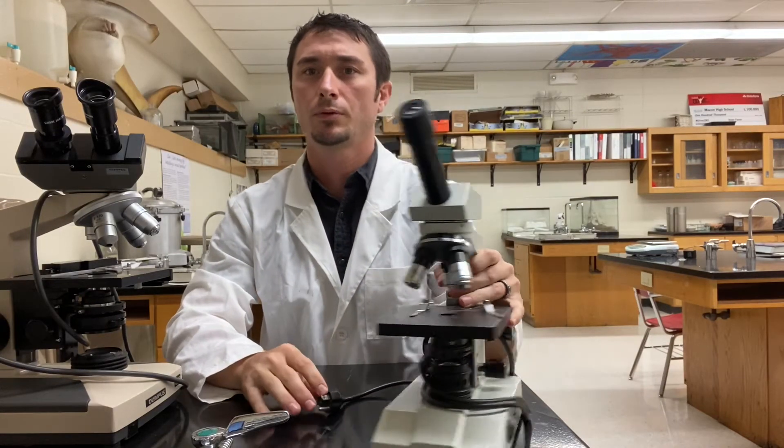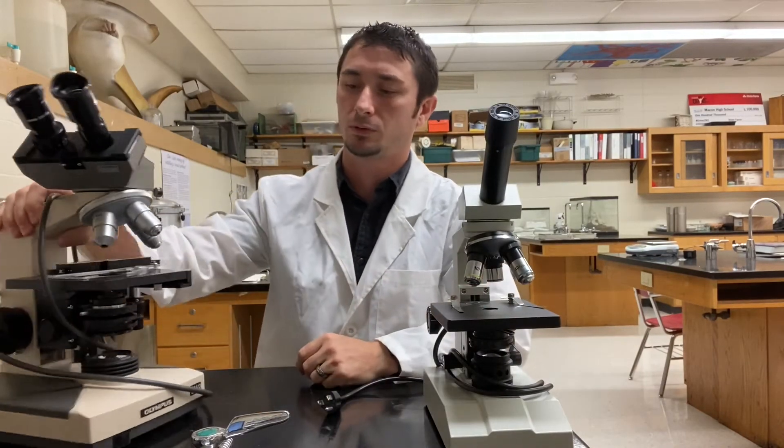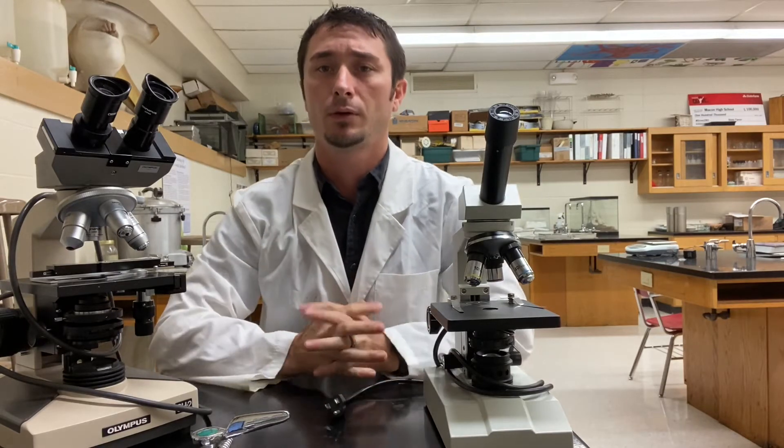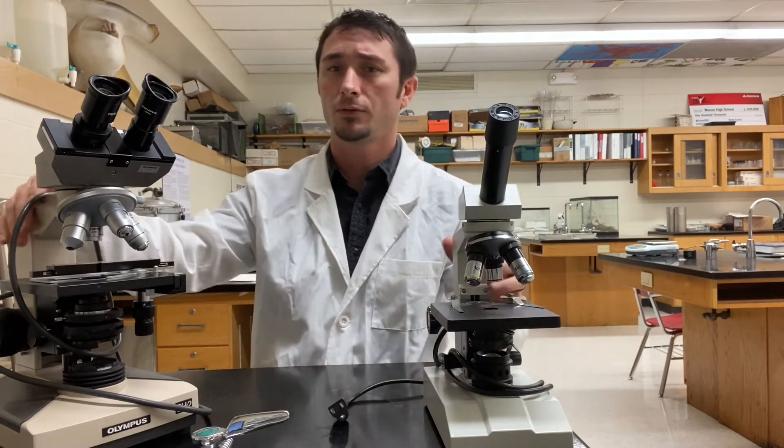Hey there biology students, today we're going to talk about some microscopes because when you get back, that's what we're going to be starting to do — microscope stuff. This video is going to talk to you a little bit about the pieces and what they do, so that when you get back you'll have an understanding of the parts.